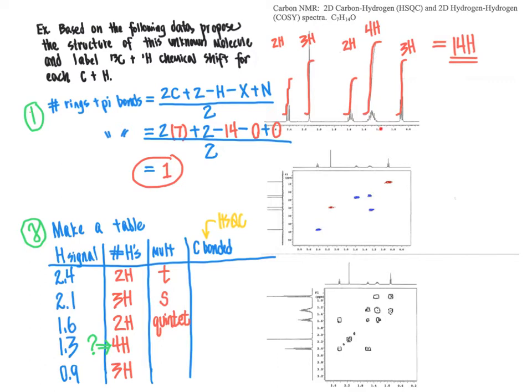We come on upfield to 1.3 ppm. That is definitely a complex splitting pattern going on there, so we'll call that a multiplet. And then at 0.9 ppm, we have this signal here, which, again, due to the fact that I've scribbled on it, we can't see very well, but if we take a look at what we have written there, we would see that is a triplet present there. So I'm going to put a T for triplet. Then we go onward looking at this puzzle.